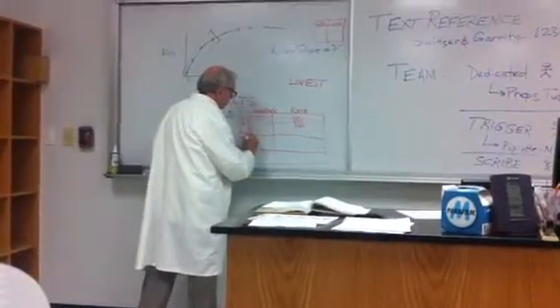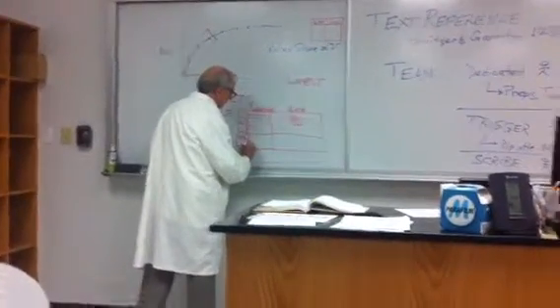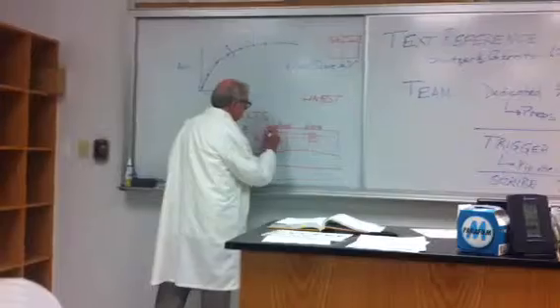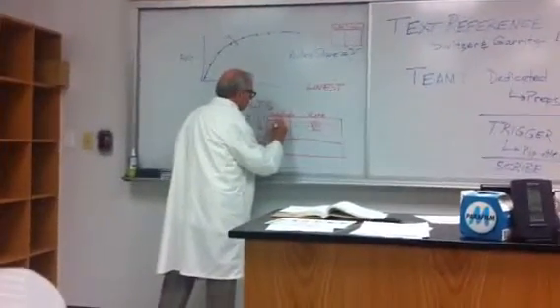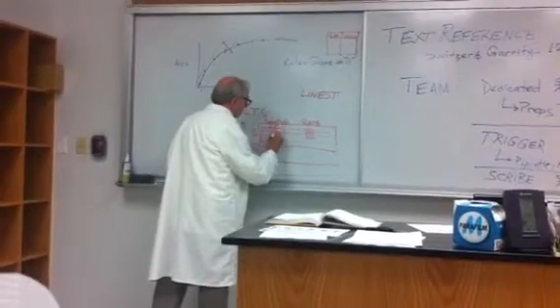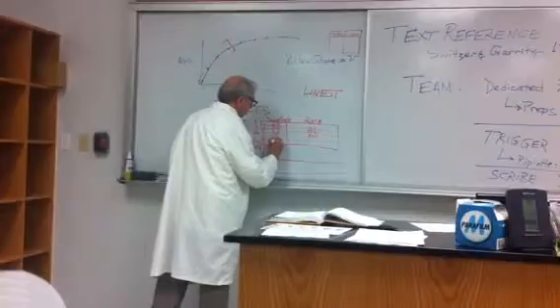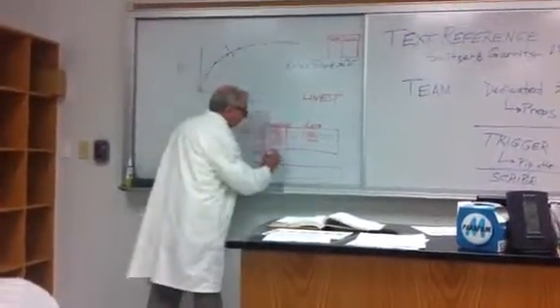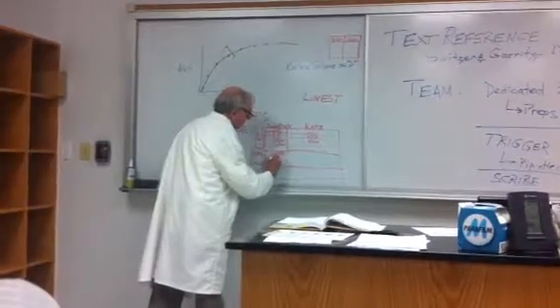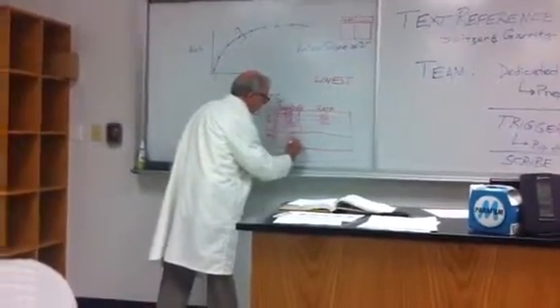Again, you have tubes 7, 8, 9, 10, and 11. And then it's the same substrate concentration. 2.5. What did I just say? 1.5, 1.0, 0.75, and 0.5. Yeah, and same thing over here. 2.5. See it? 1.5. You can organize it how you see fit.